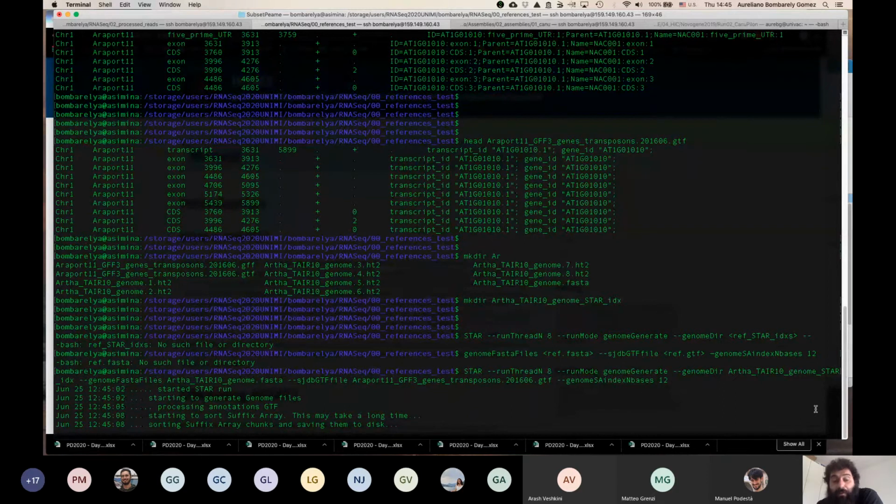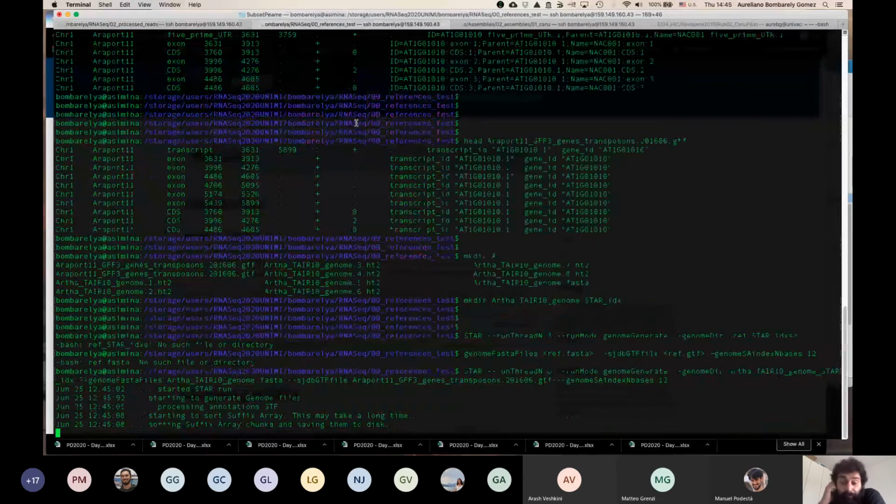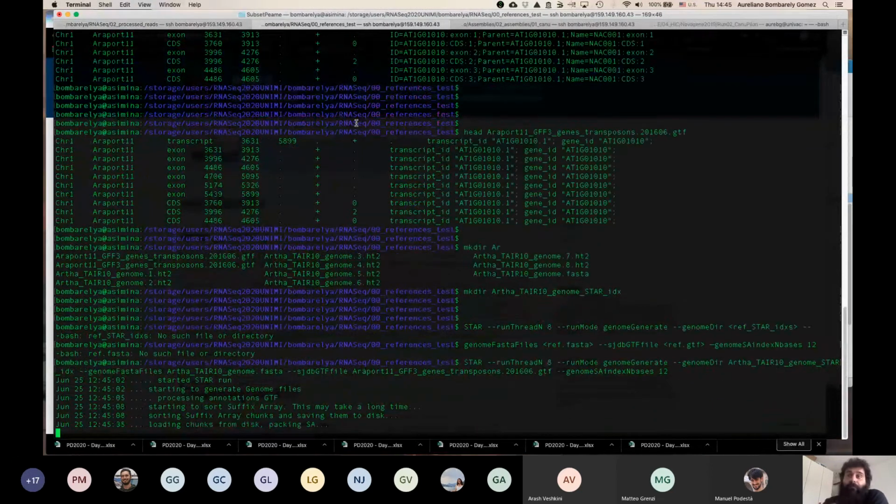Any question that you may have until this point? Let's check. The mapping is still running.